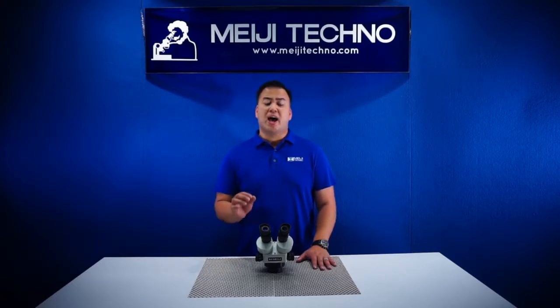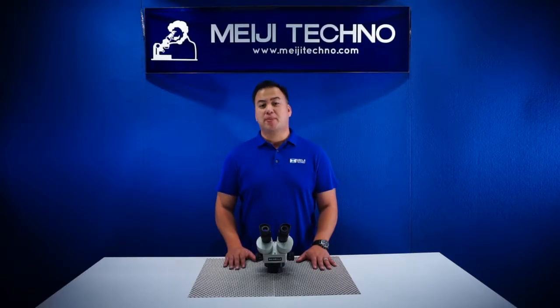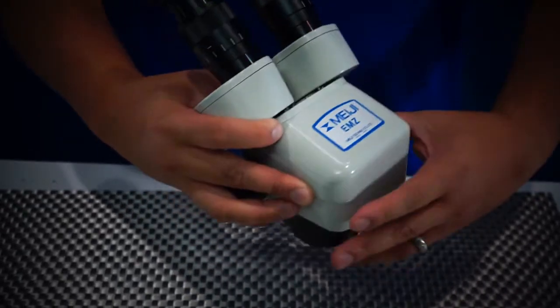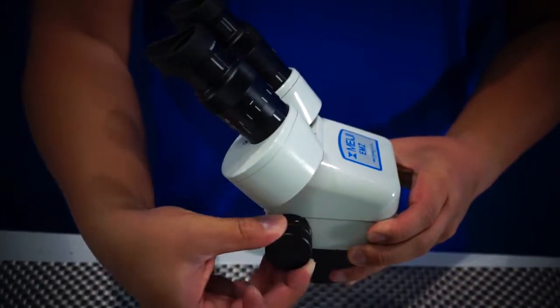The EMZ5 delivers crisp, high-resolution precision optics giving an excellent erect unreversed stereoscopic image. The EMZ5's zoom range is 0.7x to 4.5x with a ratio of 6.5 to 1.